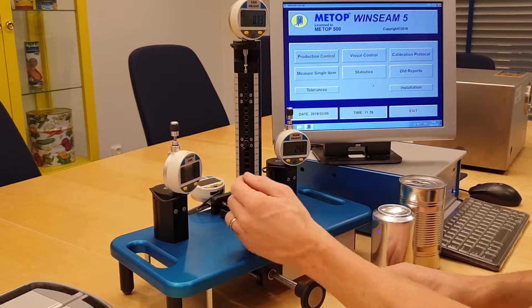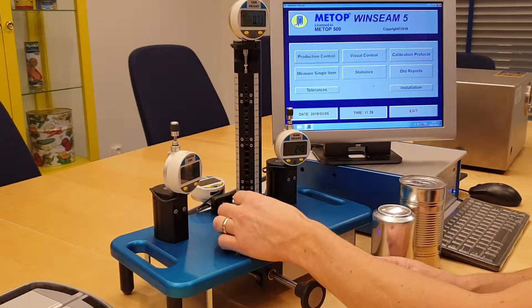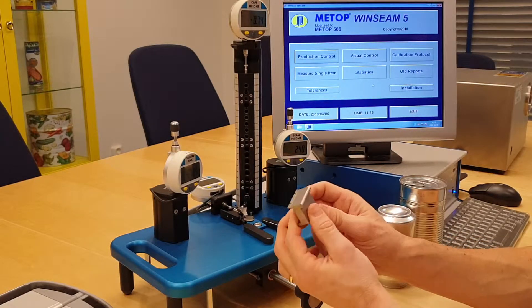No need to move around the can or to turn it upside down or anything. Very easy to calibrate as well. We use one single calibration block for all four parameters.